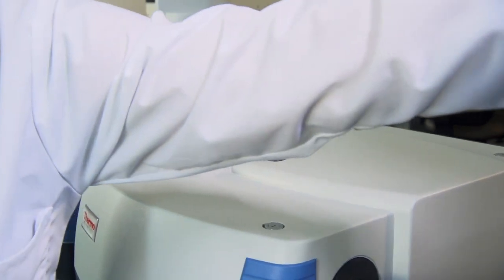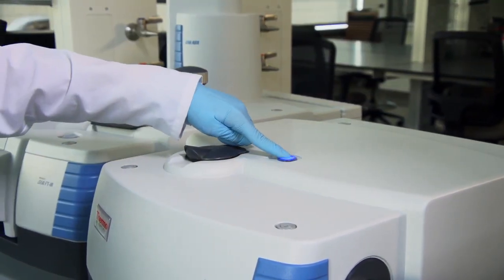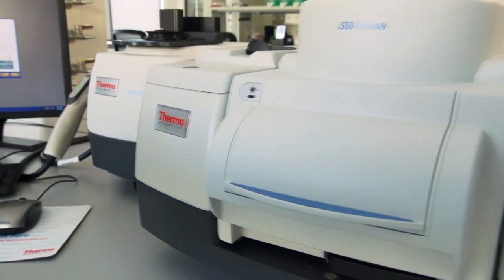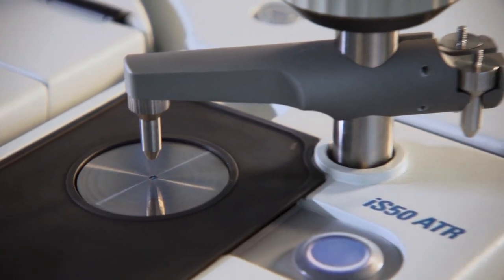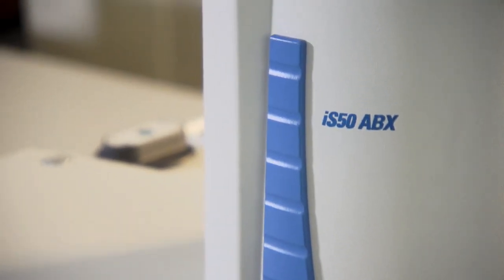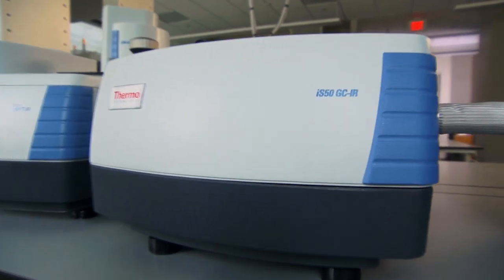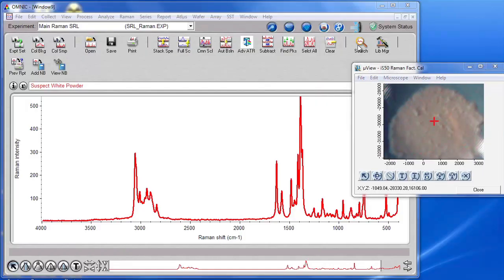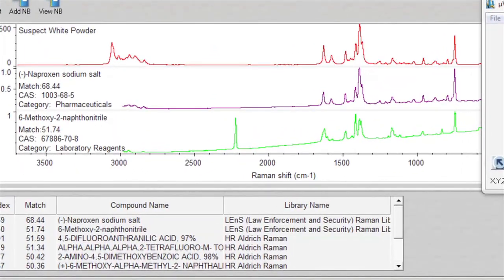Fast, easy, consistent, and cost efficient. The ultimate forensics analysis workstation with integrated ATR, multi-range sampling, automated beam splitter exchange, coupled with chromatography, always ready for use. And exclusive OMNIC software that removes subjectivity from your work.